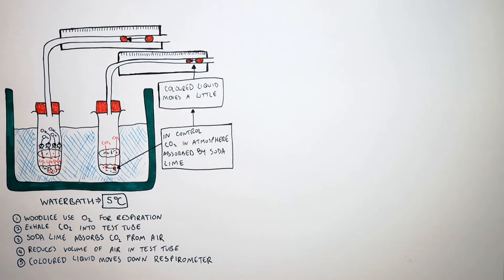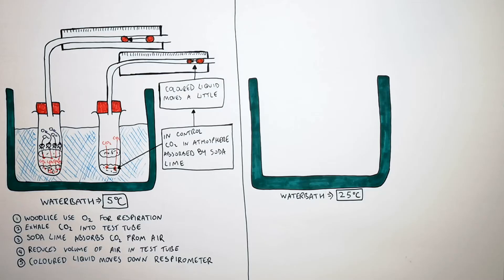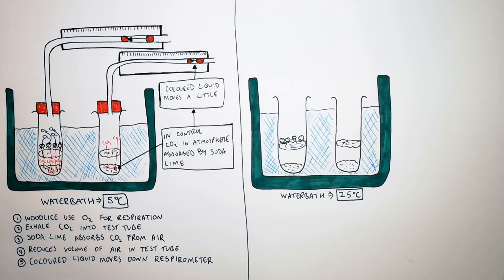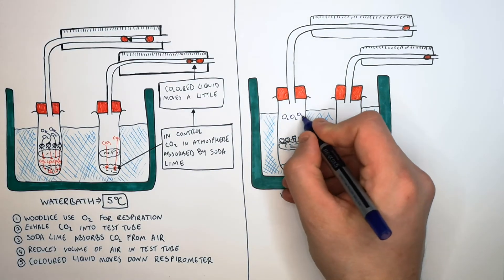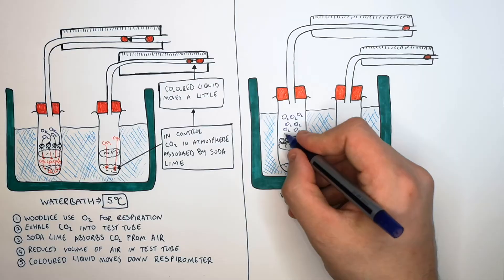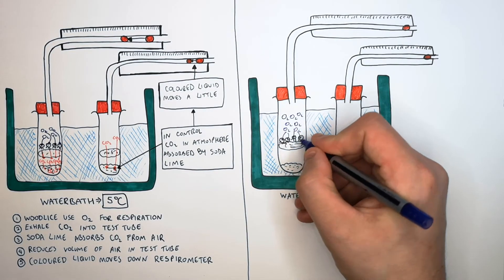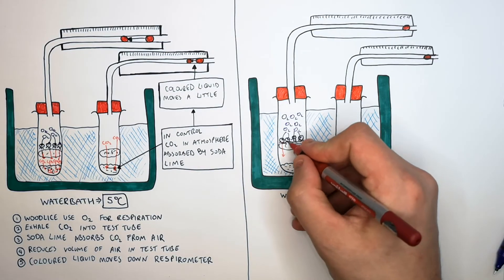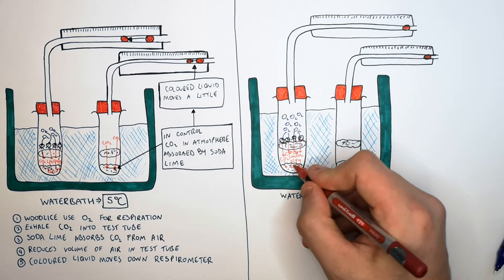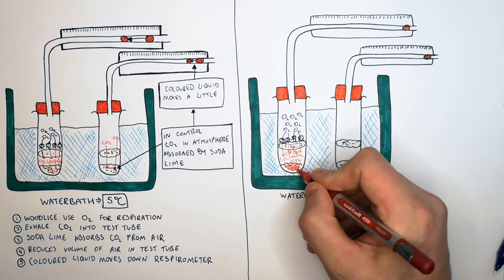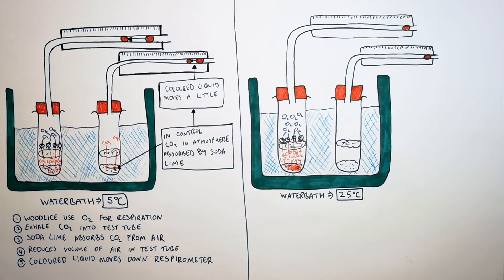Now we're going to measure the rate of respiration in wood lice in a water bath set at 25 degrees Celsius. Remember to use the same number of wood lice, the same volume of soda lime, and the same cotton wool in the same test tube as in the previous run at 5 degrees Celsius, and the same respirometer. At 25 degrees Celsius, we're going to see an increased rate of respiration because the wood lice are more active, so they inhale more oxygen and release more carbon dioxide, which is then absorbed by the soda lime.